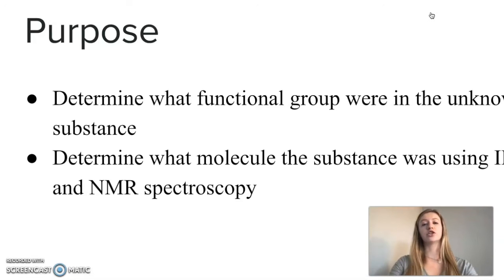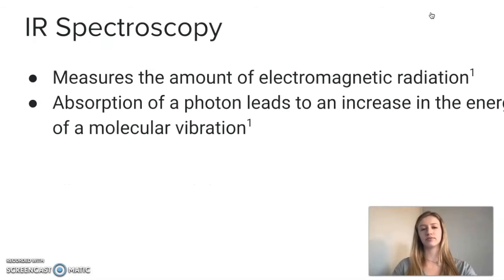The purpose of What's in the Water was to determine what functional groups were in the unknown substances, and then to eventually determine what molecule our substance was. IR, infrared spectroscopy, and NMR, nuclear magnetic resonance spectroscopy, were used in order to determine what the substance was.